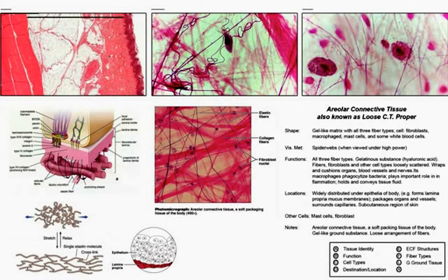We'd move through the dermis, the thickest layer of the skin, into the hypodermis here. We can see a number of large blood vessels. There's an artery, there's a large vein, and the adipose connective tissue that makes that structure of the hypodermis or subcutaneous layer up, and skeletal muscle just beneath that as we move in towards the skeletal muscle's attachment to bone. This is a great picture showing the same sequence of cells and tissues as we move inward, and the bundles of muscle that would be present in that slide.